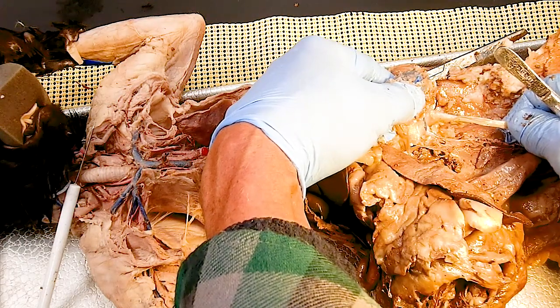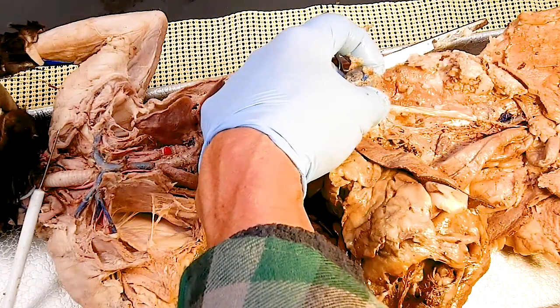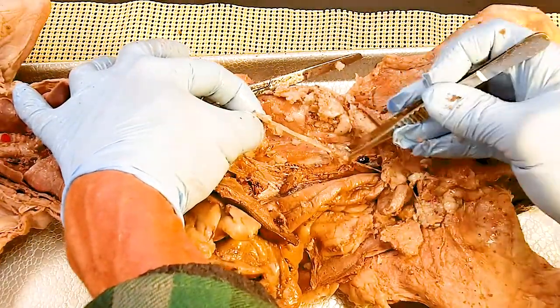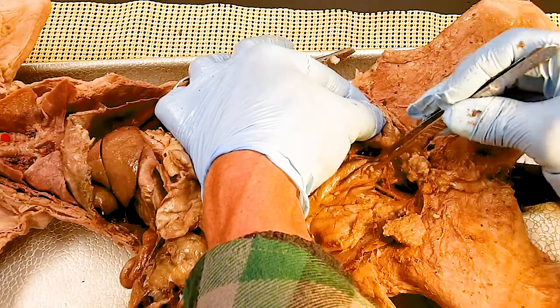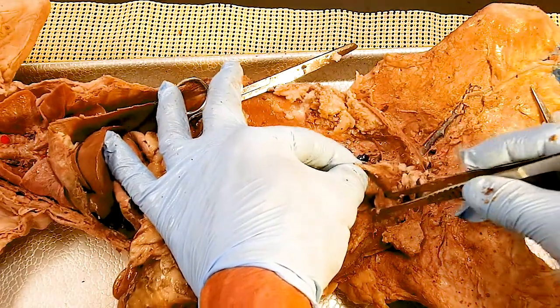They usually look kind of pale white on our dead cats. Ureters will come down. Slide this cat out of here. Get my camera. So here's your ureter. Comes down, comes down, comes down, and enters the urinary bladder, which is right here. So you'd have two ureters. The one on this side is no longer intact. Got one ureter coming to the bladder. There'd be one on the right.